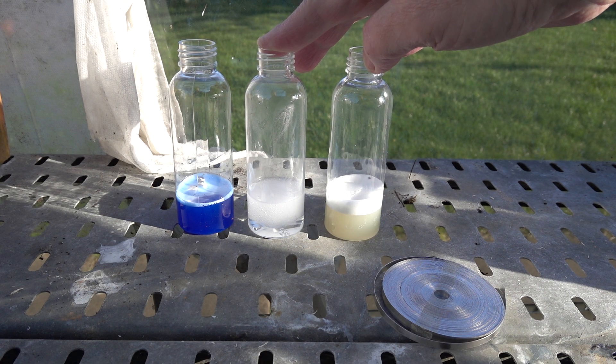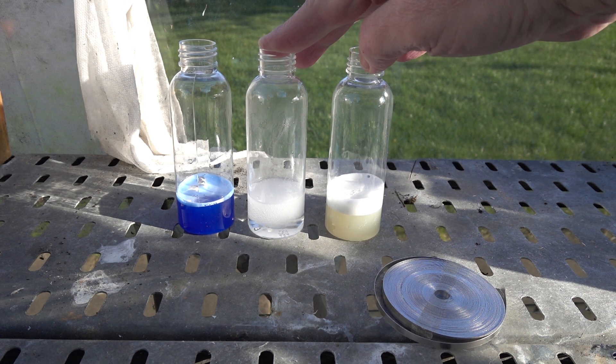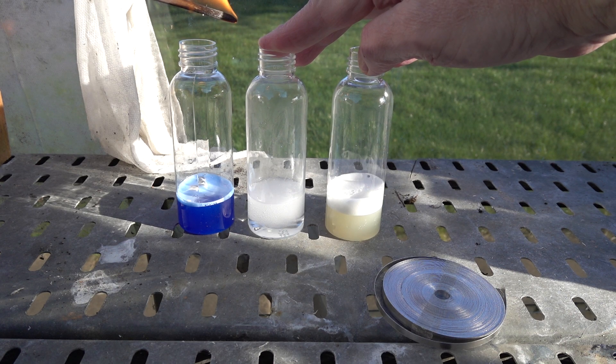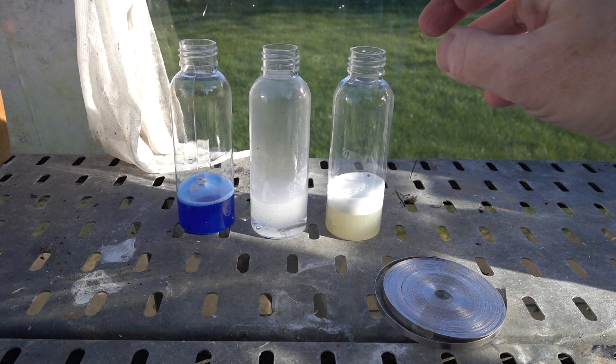We've been going for a minute or so here. Let's give it a go with the splint and see if we can detect any hydrogen. Here's the splint — and we've got a reassuring positive hydrogen test there.